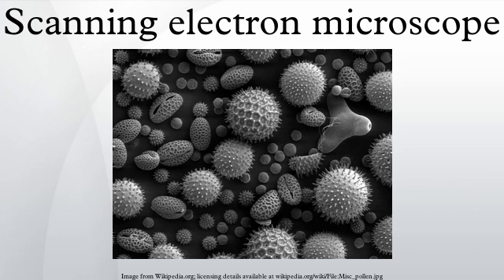Optionally, the standard secondary electron image can be merged with one or more compositional channels, so that the specimen structure and composition can be compared. Such images can be made while maintaining the full integrity of the original signal, which is not modified in any way. Detection of secondary electrons.